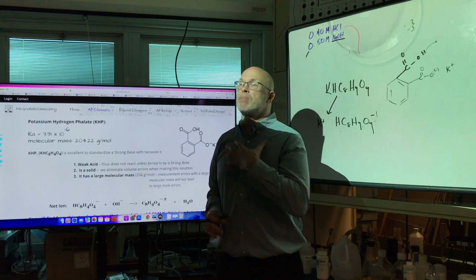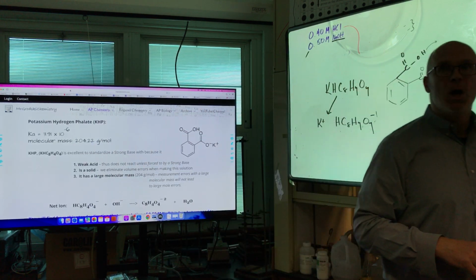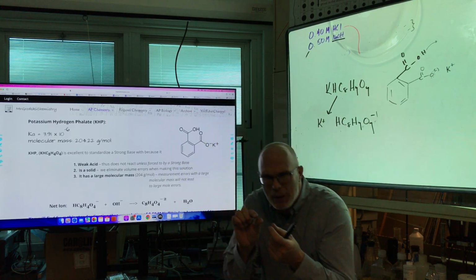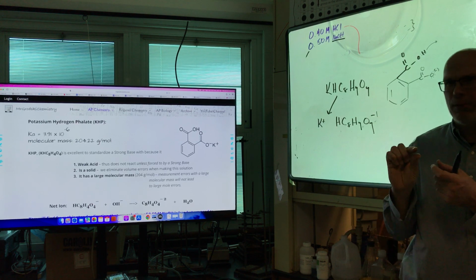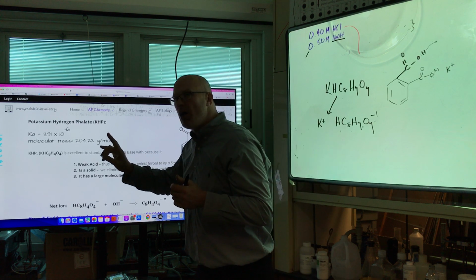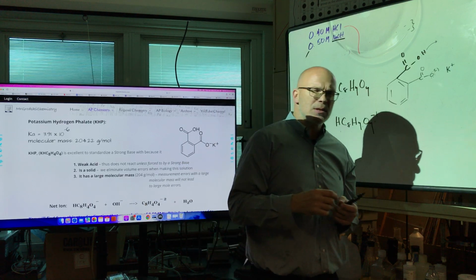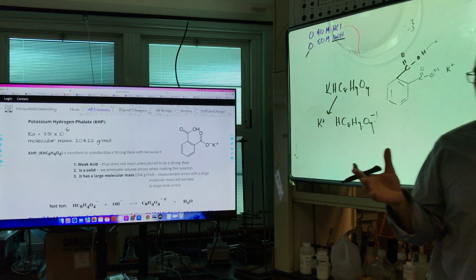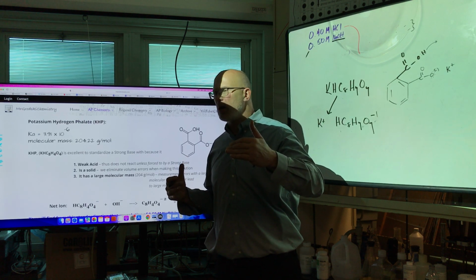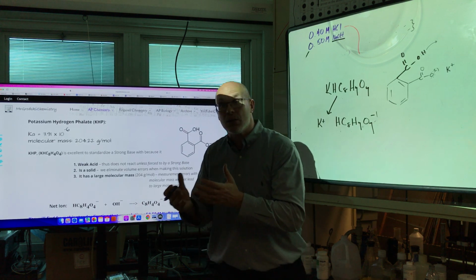Now, there's a reason why KHP is beautiful to work with. Number one, it's a weak acid. Do you think it's going to react with anything in the air? No. Number two, it's not a solution. There are no drips to make sure I got every little drop, like I had with HCl. It's a solid. Second thing, it's got a high molecular mass. When I measure it, if I make a mistake measuring the mass with a big molecular mass, do you think I could overcome that error? If something has a small molecular mass per mole, and you make a small little error, it's a lot of what? Molecules not counted.